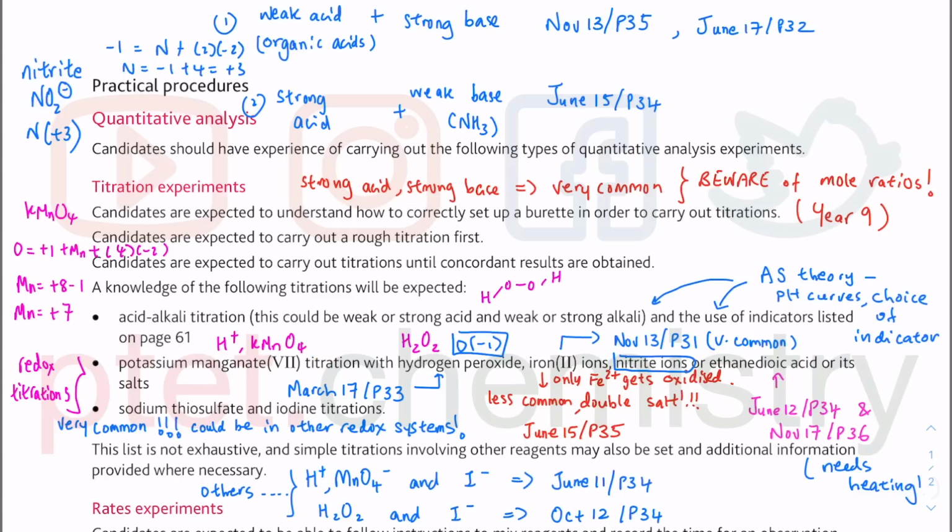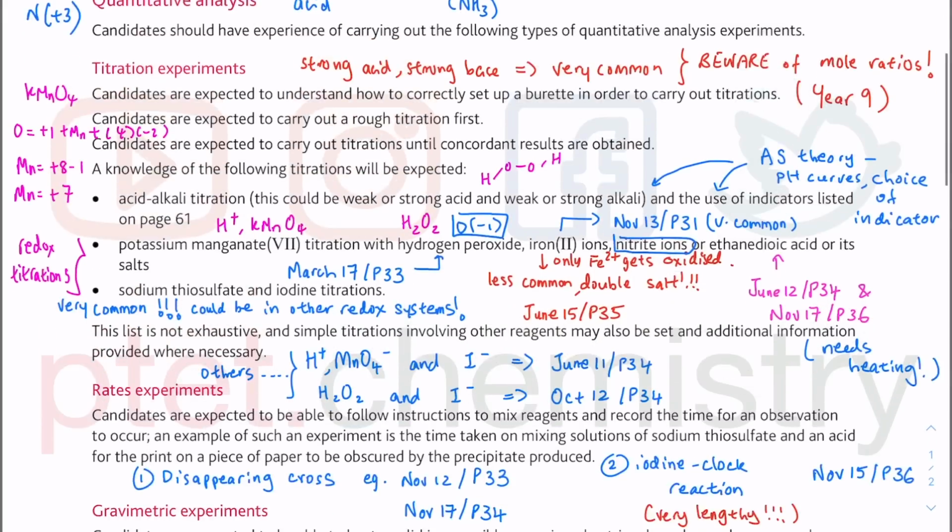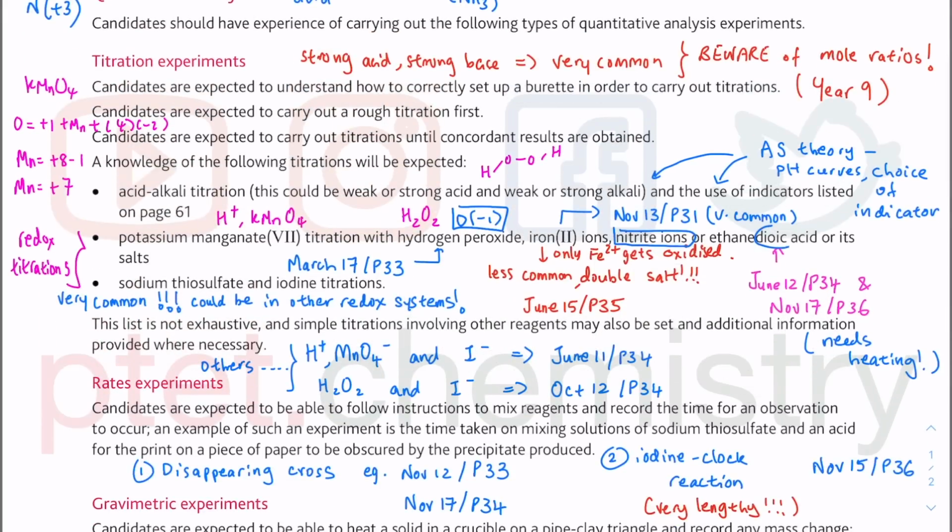Ethanedioic acid is a carboxylic acid, but the name itself is dioic acid. That is because ethanedioic acid contains 2 carbons, and both the carbons are carboxylic acids. This is quite unusual and is actually stated in the A2 syllabus. Titration of acid and base was in the previous tutorial, but what we are doing here is not an acid and base reaction.